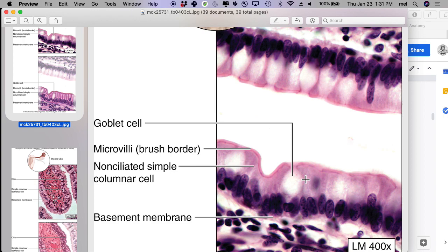Nope. Yeah, lining the small intestine. Any idea what the goblet cells are doing? Yeah, but why? Why there? Lubrication, also digestive breakdown, those kinds of things. That's what it's doing there. So when you see a goblet cell, it's going to produce a product and dump it onto the surface. And you can start thinking about structure-function relationships when you do this.